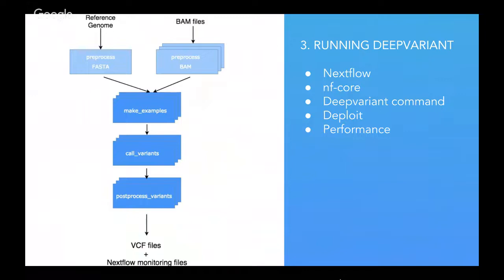It was initially published by Google, and you can find it. But we will present our approach to putting together all the pieces made available by Google, and how to streamline DeepVariant and combine it in any kind of analysis in a really nice and easy way.